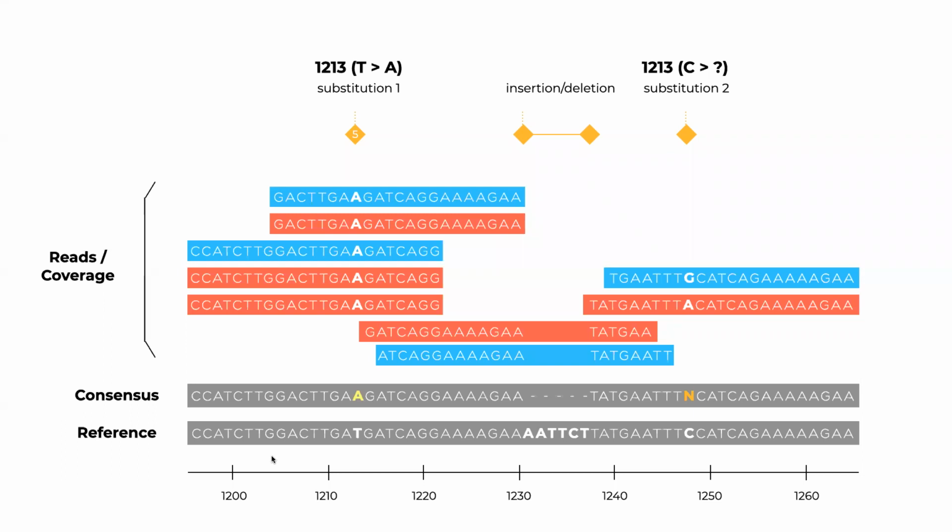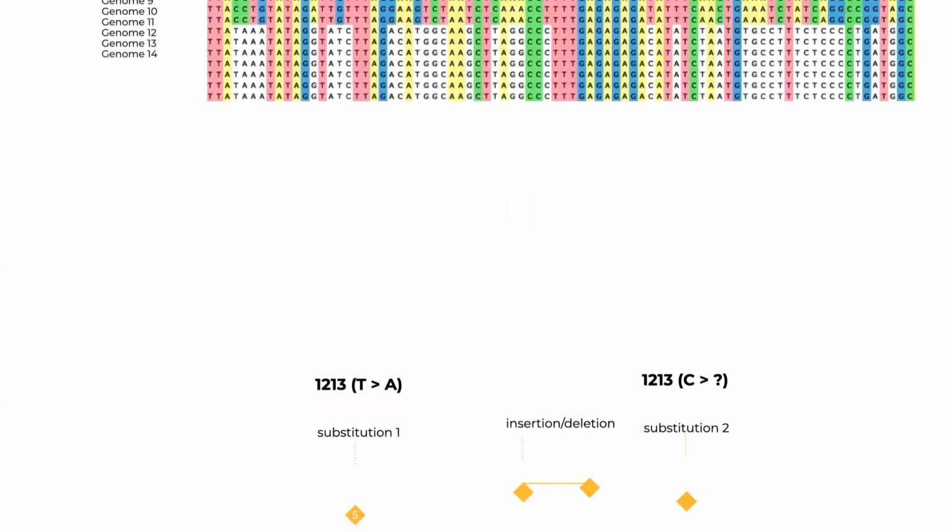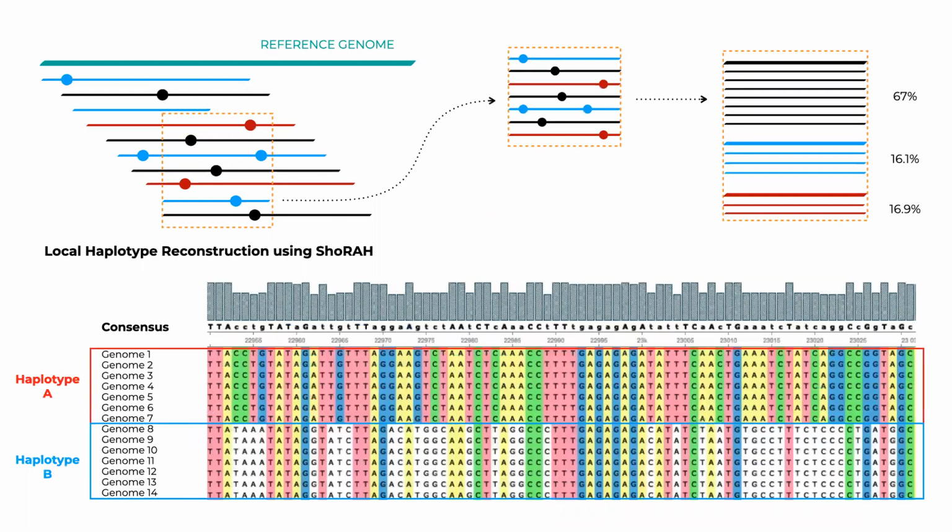There's another type of analysis that we can solve using this kind of study when we have SRA files. SRA files are generated directly from a biological sample, and that biological sample actually represents a collection of different genomes that are present in that sample. Because when a virus comes into the cell and starts replicating, not every single genome that it reproduces is exactly the same as the virus that entered the cell. So when we take biological samples, we typically have a number of different cells, and so we expect to see a variety of different genomes present.